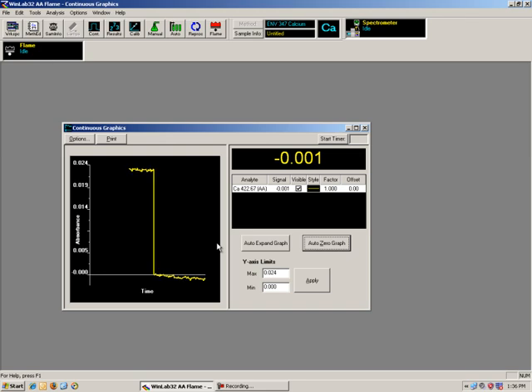We would then turn on the flame and aspirate a standard and adjust the height of the burner head, the rotation of the burner head, and the orientation in and out of the light beam on a horizontal plane. And using all of those, we would try and maximize that absorbance.